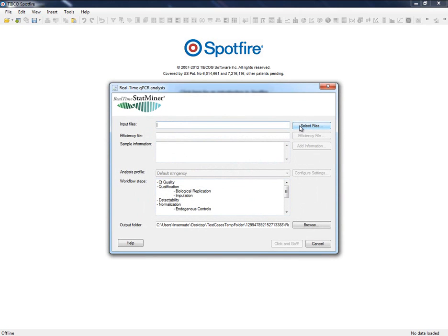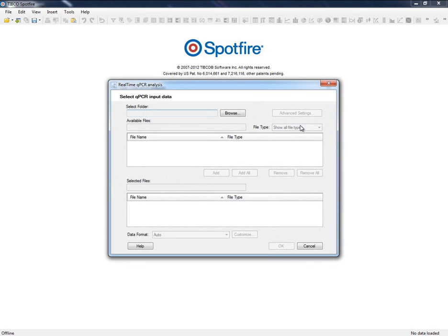In this step of the wizard, we will be able to get our data, prepare the experimental design, and configure analysis settings. After that, we will be ready to run the qPCR analysis. So let's start with the data files.